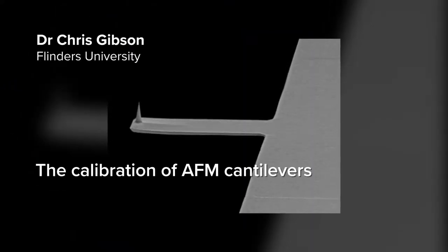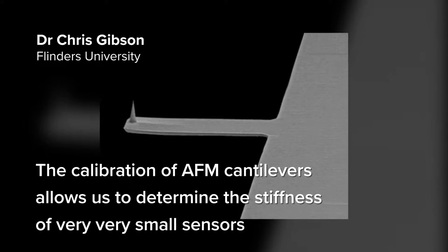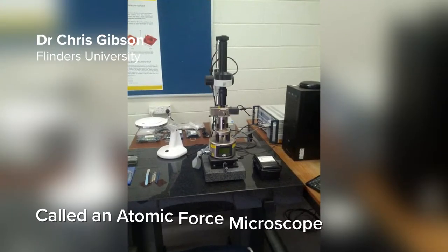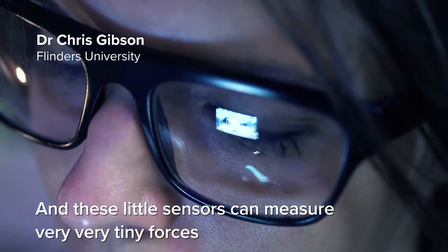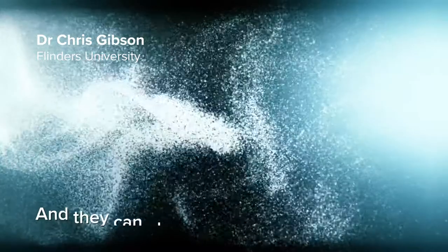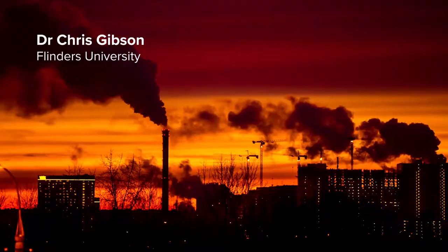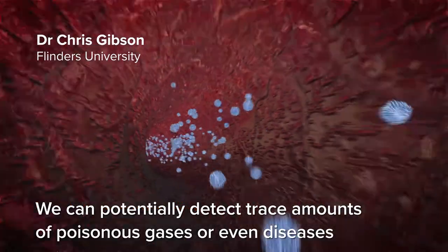The calibration of AFM cantilevers allows us to determine the stiffness of very small sensors used in a special kind of microscope called an atomic force microscope. These little sensors can measure very tiny forces, which allows us to measure the strength of molecular bonds. They can also be used to measure very small masses, which means we can potentially detect trace amounts of poisonous gases or even diseases.